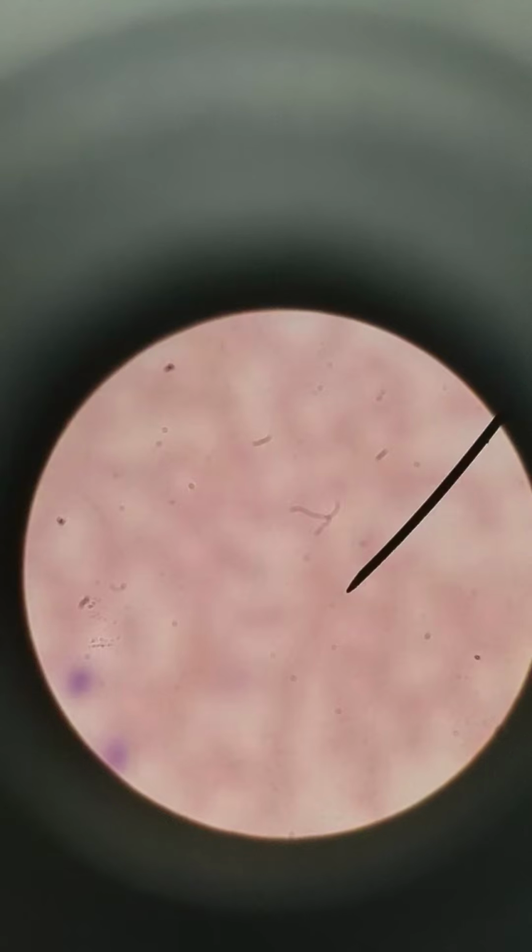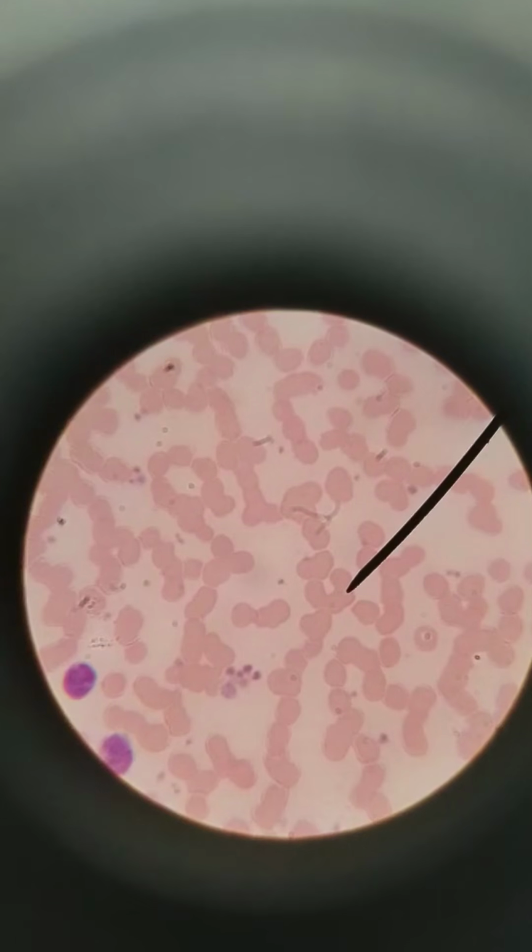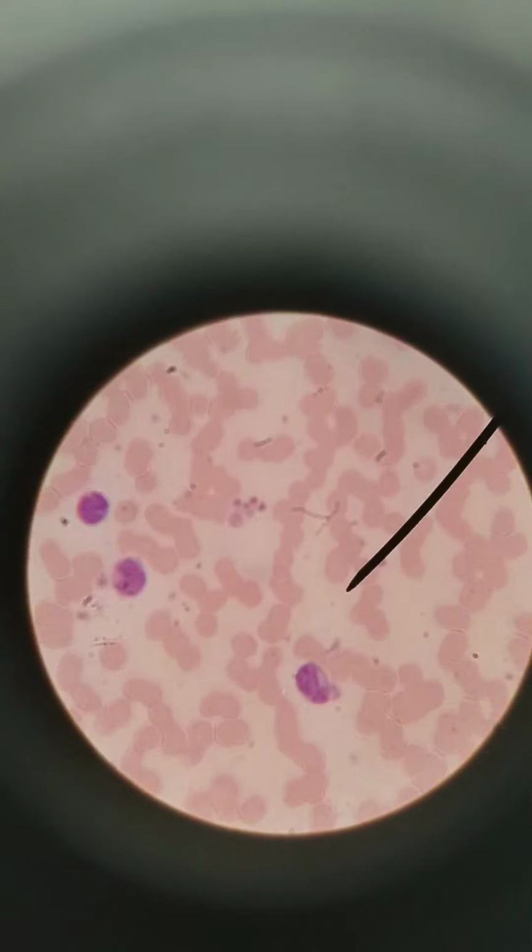This next slide, we're going to take a look at a type of leukemia. Just getting some oil and prepping the slide. Let's take a look at what leukemia means. It's some kind of cancer, a cancer of white blood cells, and there's going to be more of that cell than normal. So with eosinophilia, we had more eosinophils than normal.